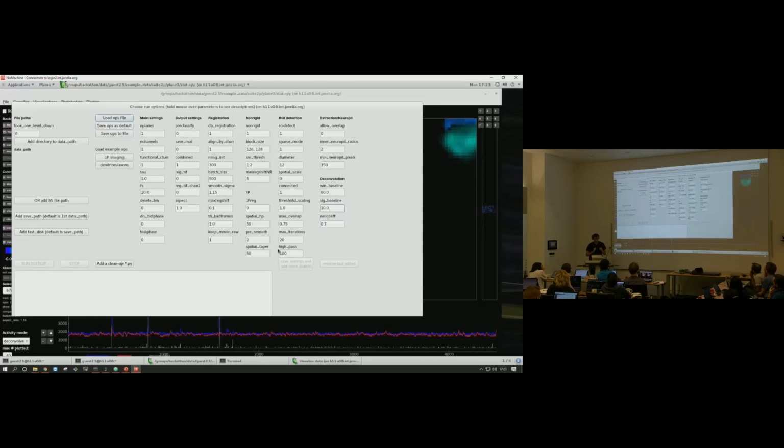And so, let's say you want to analyze the fluorescence traces from Suite2P, you should still worry for yourself: how should I baseline these traces? Do I need to do some temporal baselining? Is a single F0 maybe across the whole thing enough? Do I want to do DF over F, or should I just do DF? These are settings that we left for you because depending on what you're doing with the data afterwards, you'll want to use a slightly different processed fluorescence.